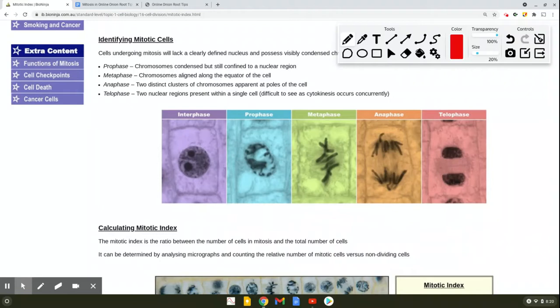So what we have here are some cool pictures of actual cells, colored obviously, but these are the chromosomes during mitosis. Okay, so actually, interphase here, this is not part of mitosis, but these four are, okay, mitosis. So prophase, metaphase, anaphase, and telophase are part of mitosis.